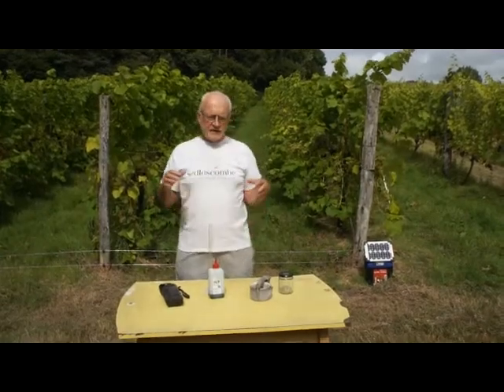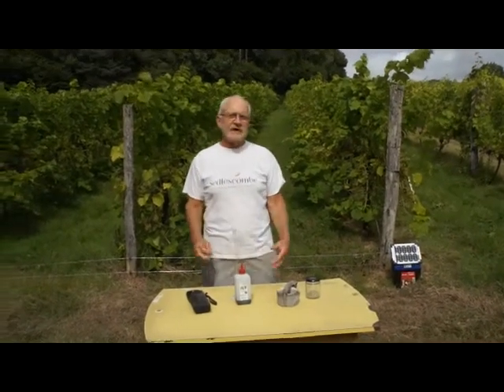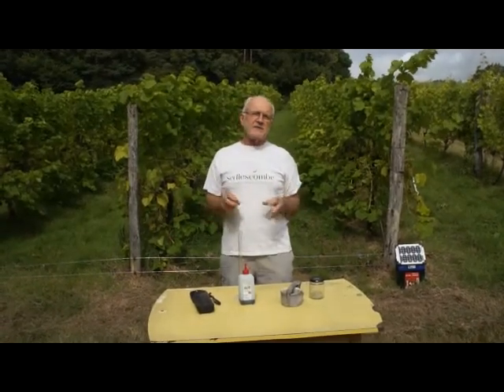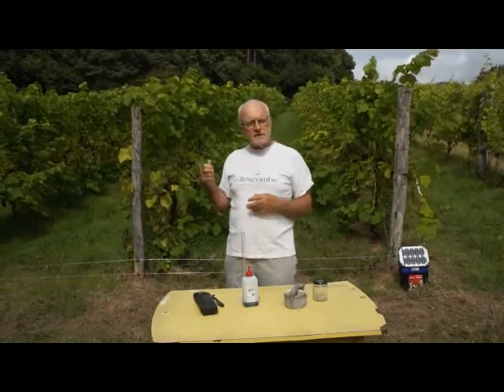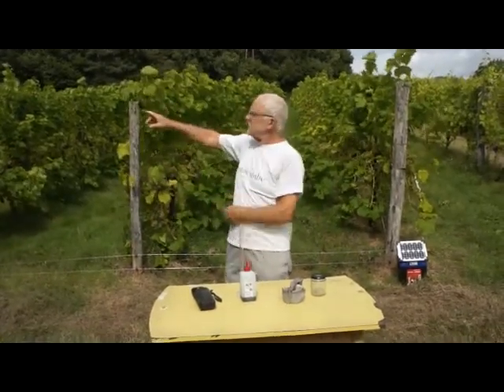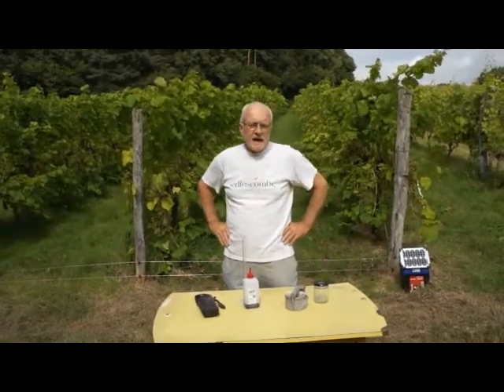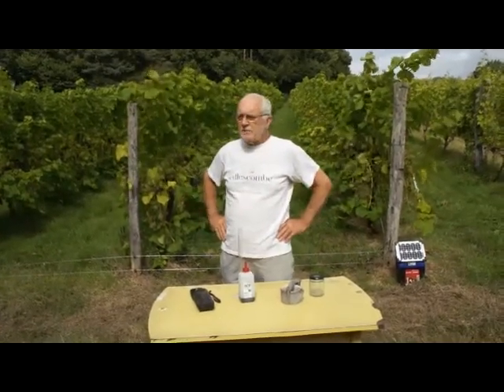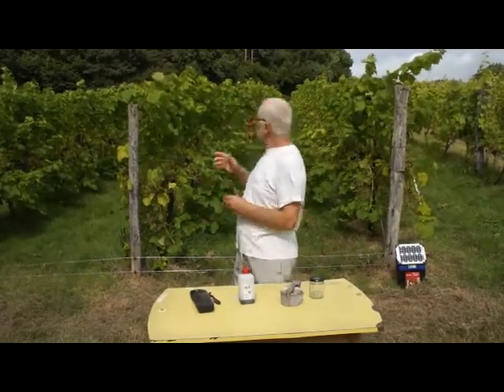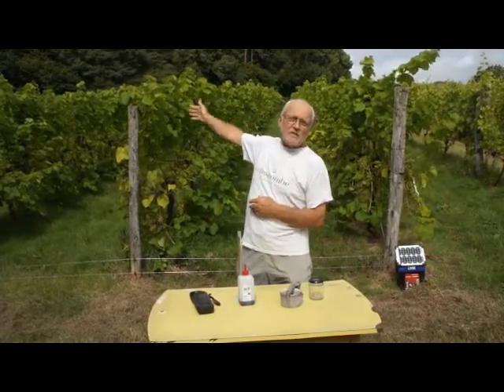In order to do this test of the sugar and acid, we're going to try to get a representative sample of the plot of vines that you can see behind me, which is 500 Solaris vines, and they're about 11 years old now. To get this sample, we're going to walk diagonally through this plot of vines.